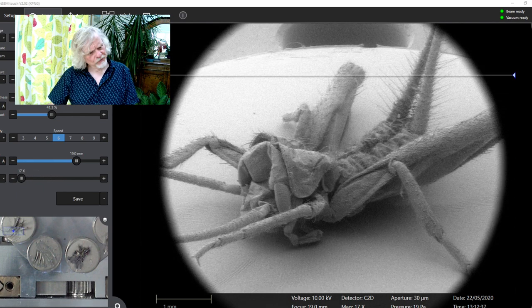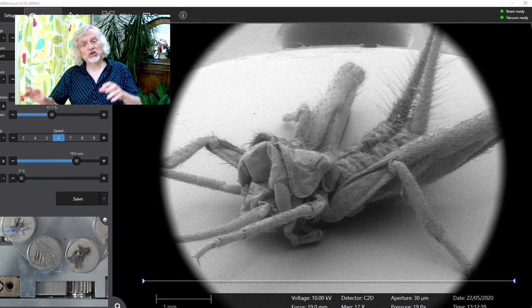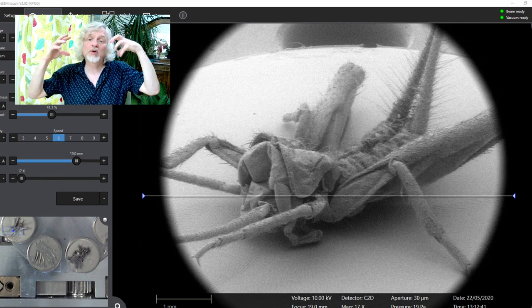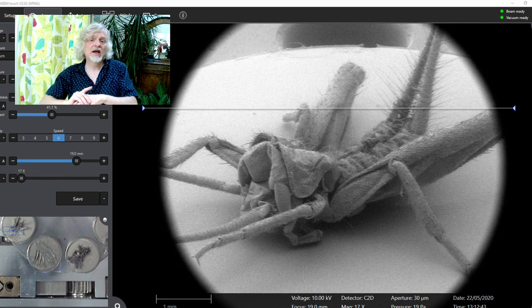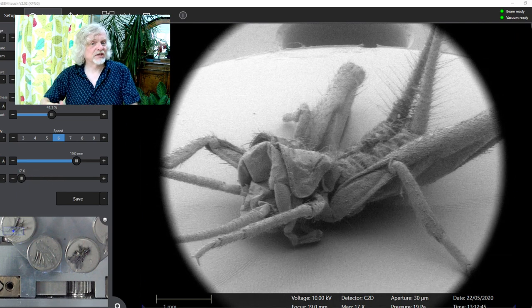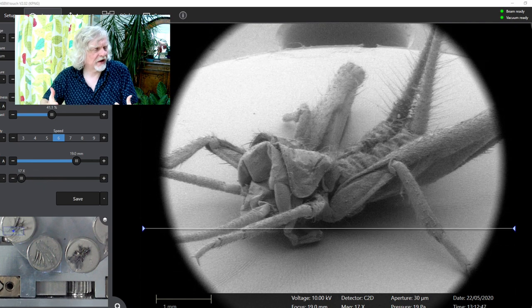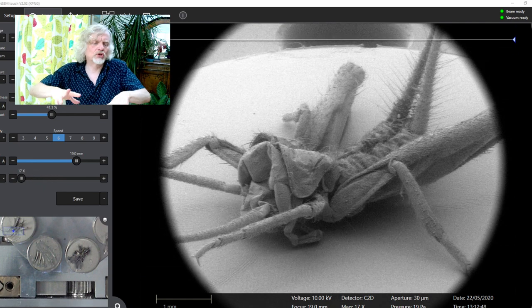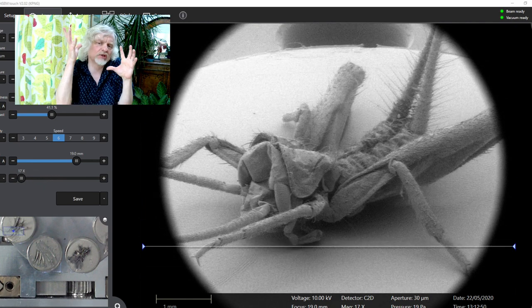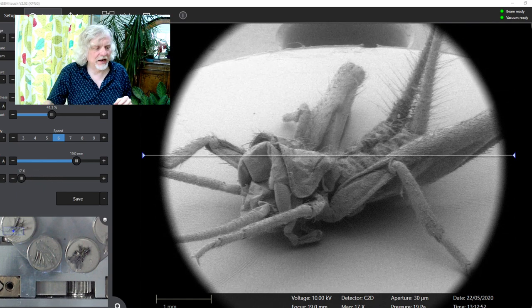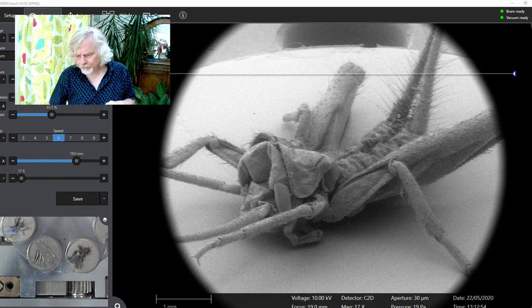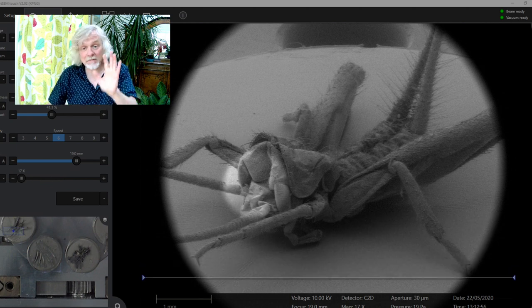So what's happened is it's sort of collapsed slightly, because when you put things under the electron microscope, they get very dried out. It's in a vacuum, a partial vacuum, and that dries them out. So here's its head, and this is a male.